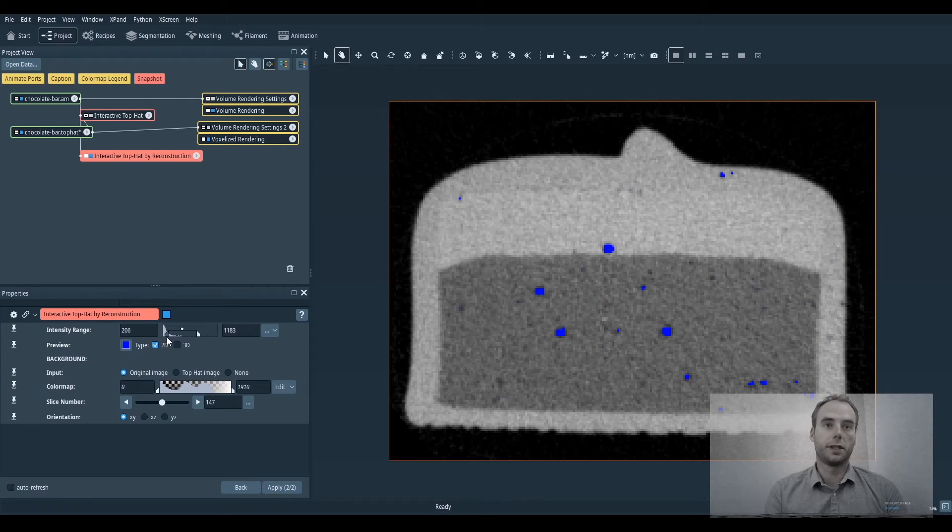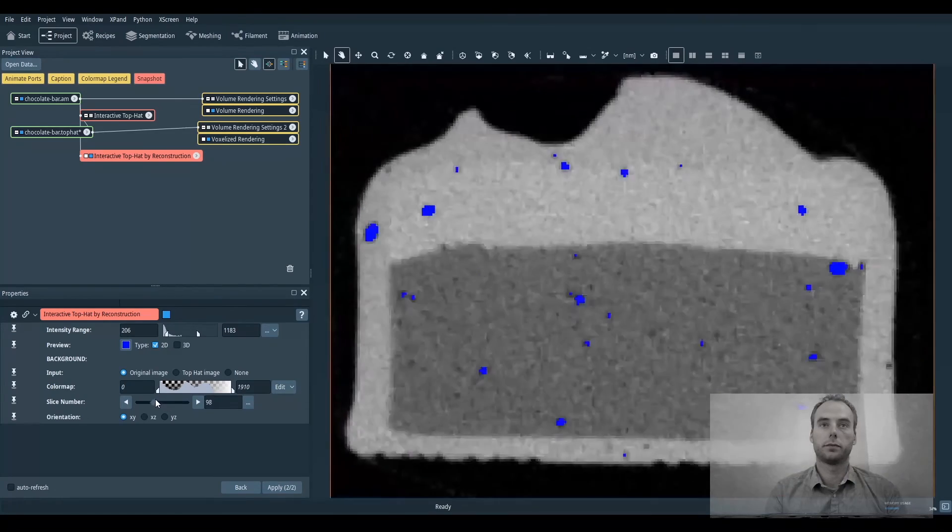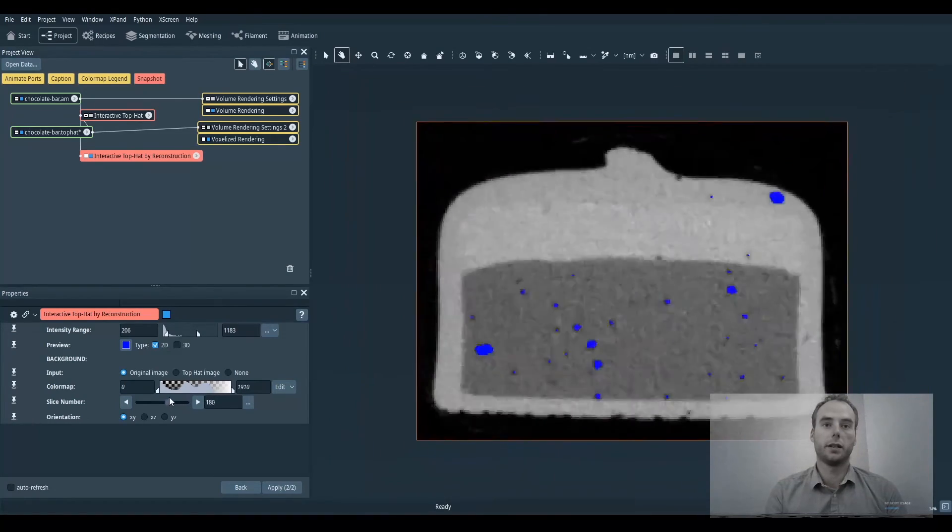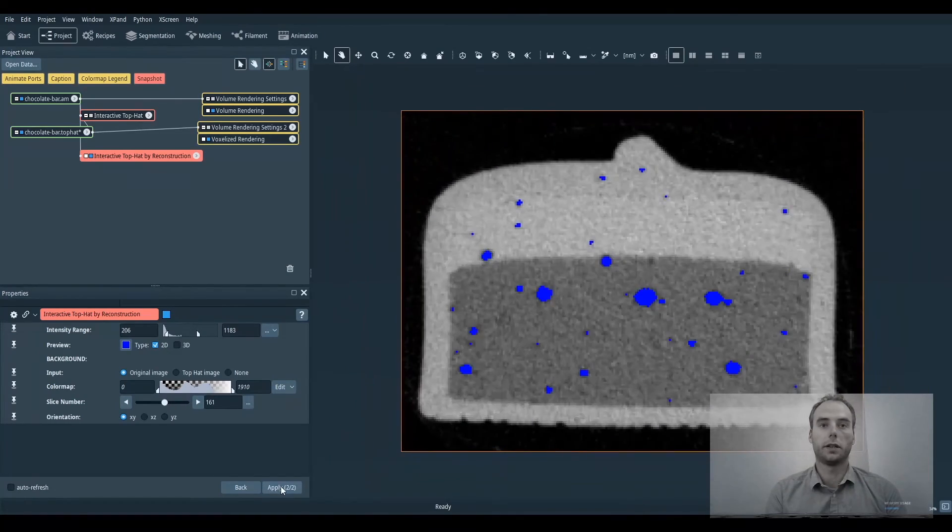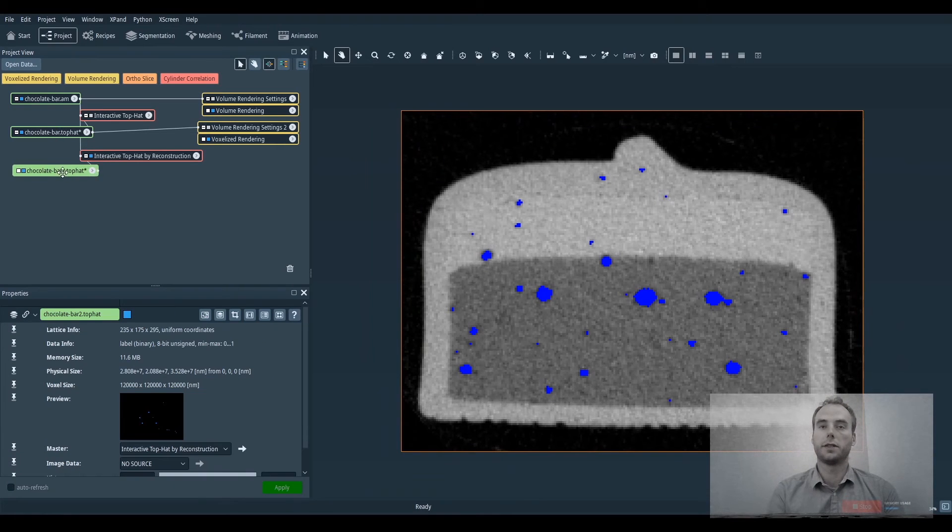You check on every slice and when you are satisfied you click on apply. So this is exactly the same as we did before.